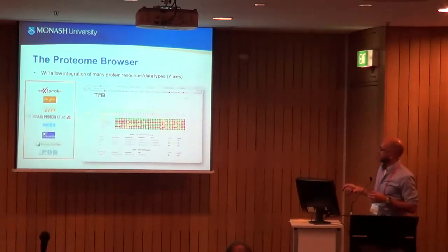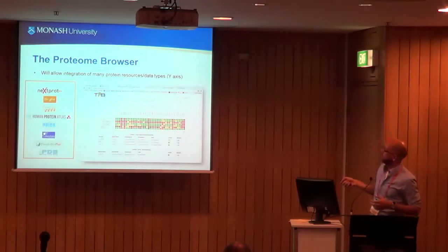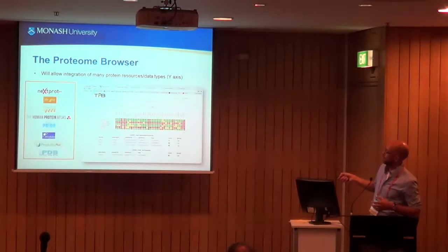So effectively, what this tool allows is a global overview for this chromosome-centric protein atlas effort. The information along the y-axis is the integration of data from various resources.